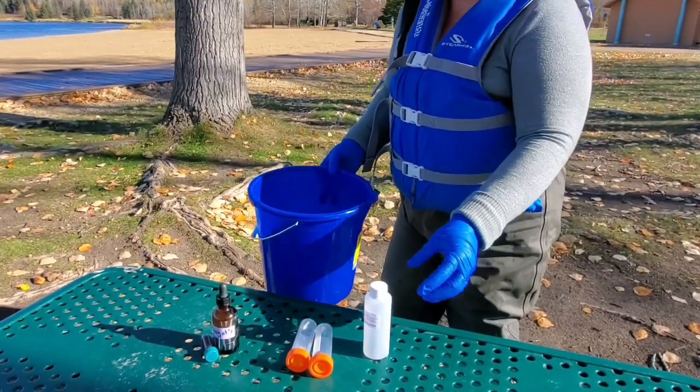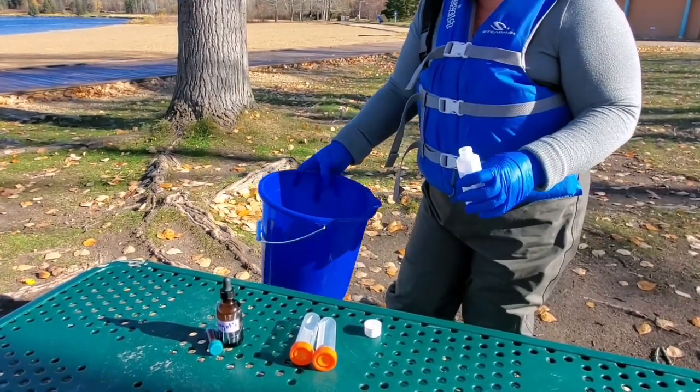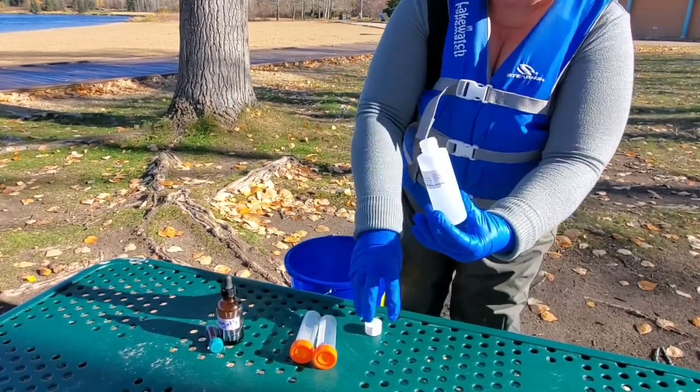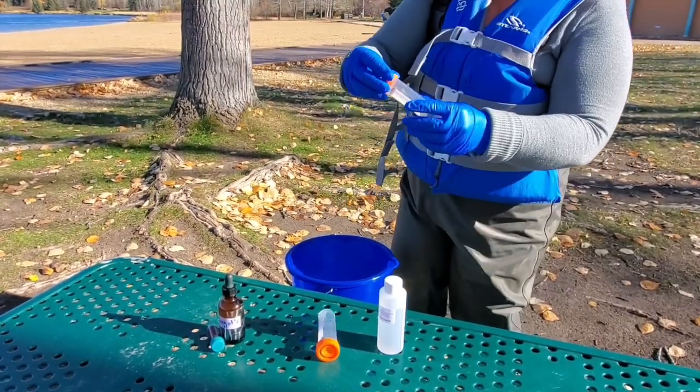Mix the contents of the pail well by swishing the water around for a couple of seconds. Using this, pour off the water into the ACFT bottle until 3/4 full. It is important to not overfill this bottle so as to leave space for the expanding water when frozen.